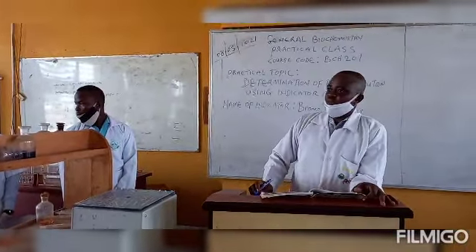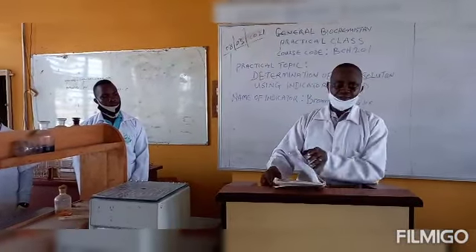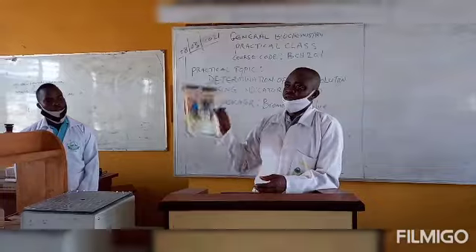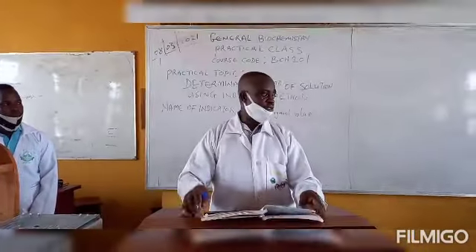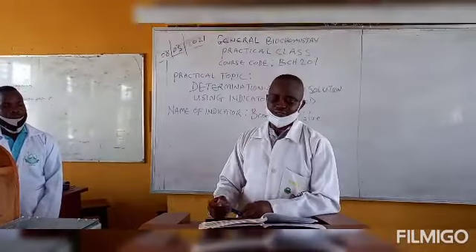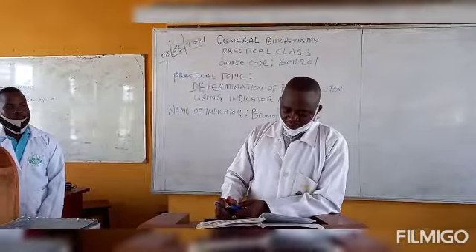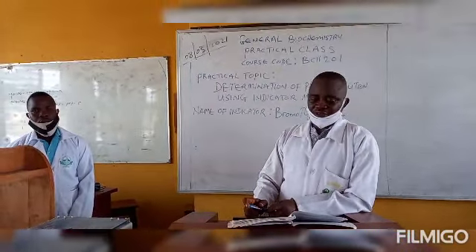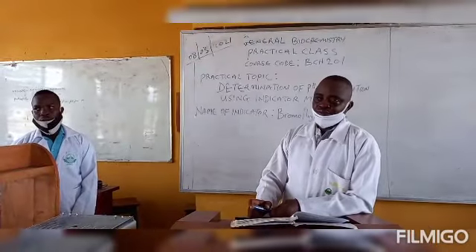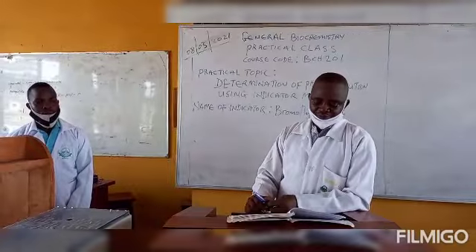Last week, I implored us to approach the biochemistry department to get a copy of the BCH practical manual, because most of the things we shall be discussing are going to be dished out from the manual. The practical procedure we shall be dealing with today is found on page 7 of the manual, under the title pH and buffer.